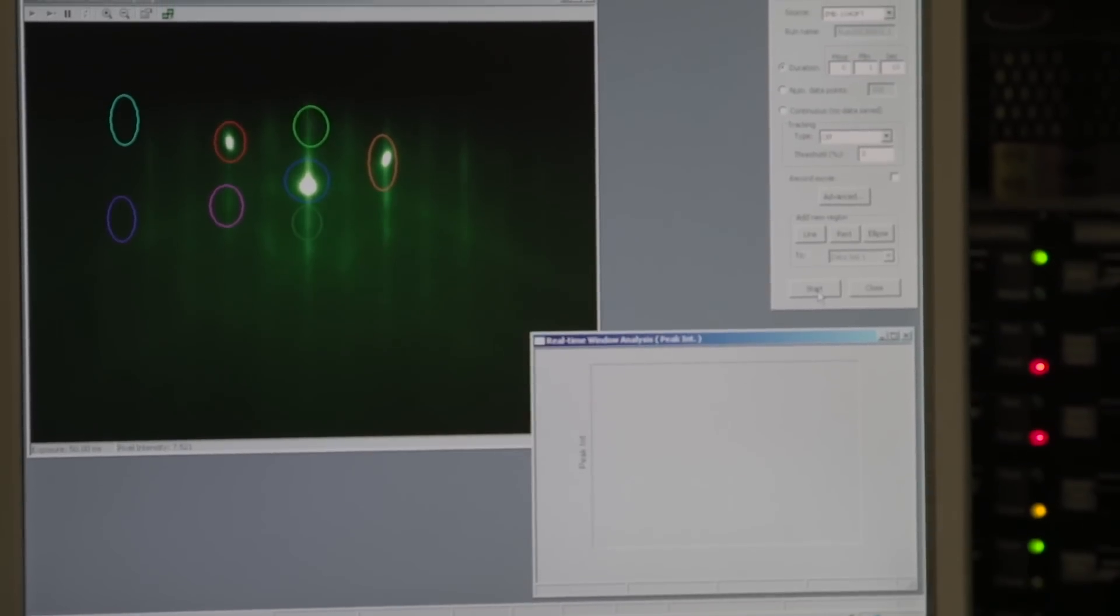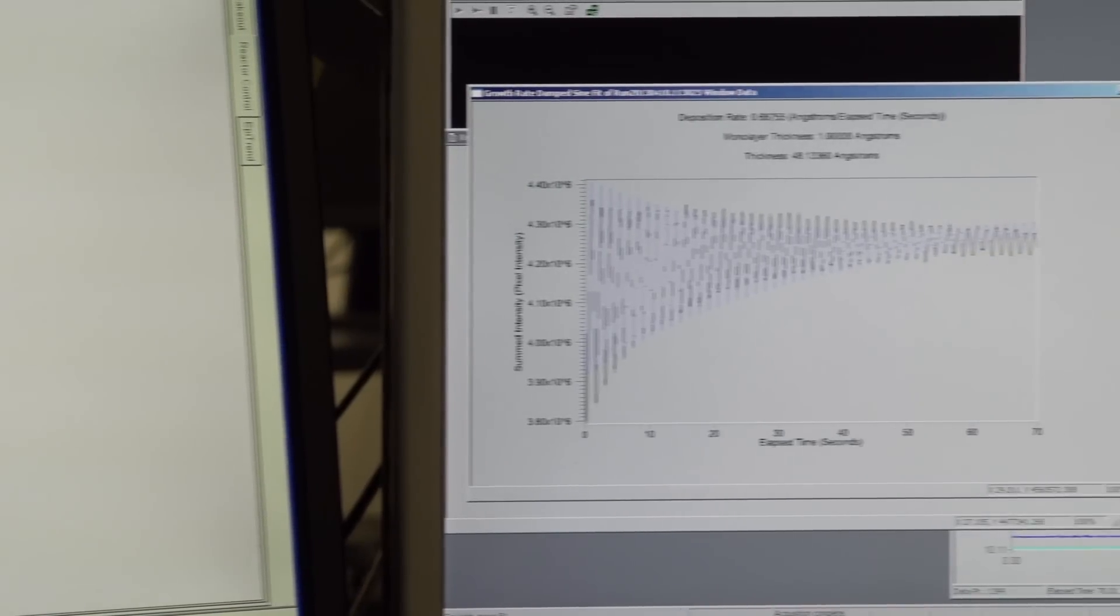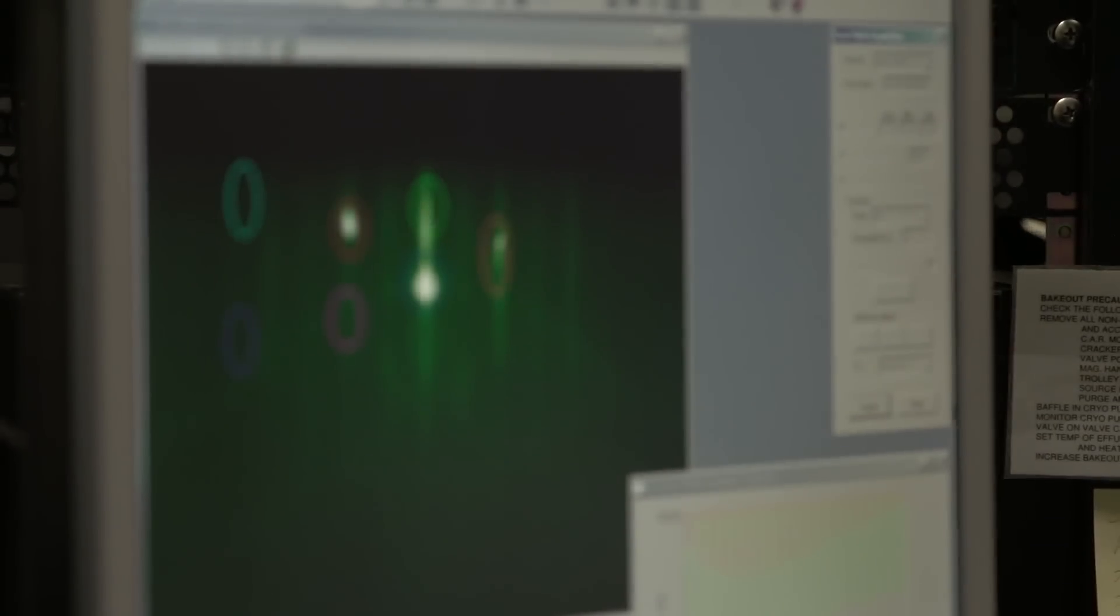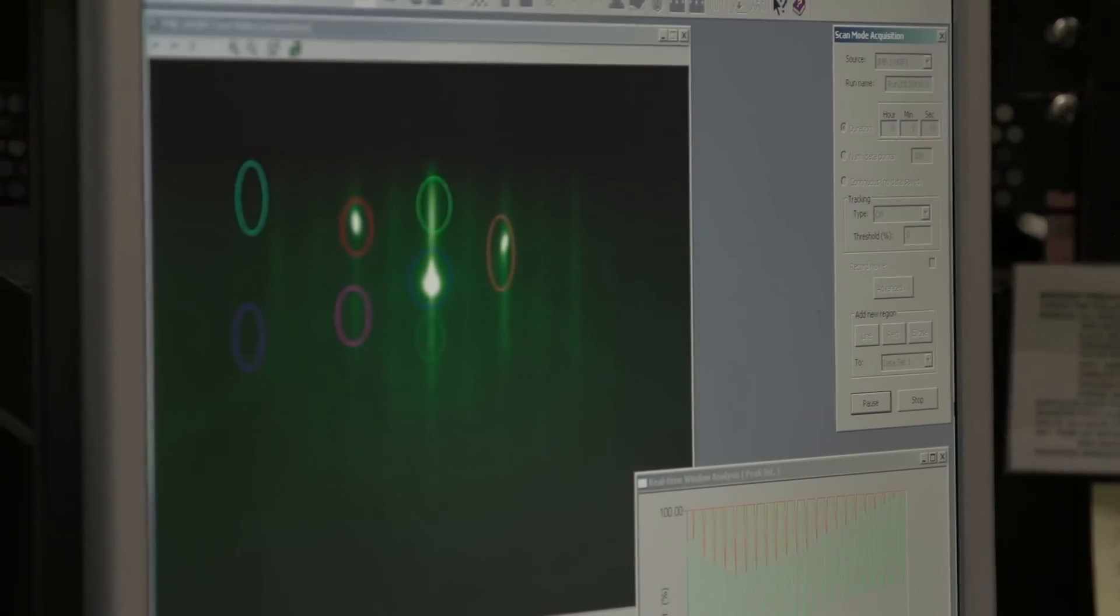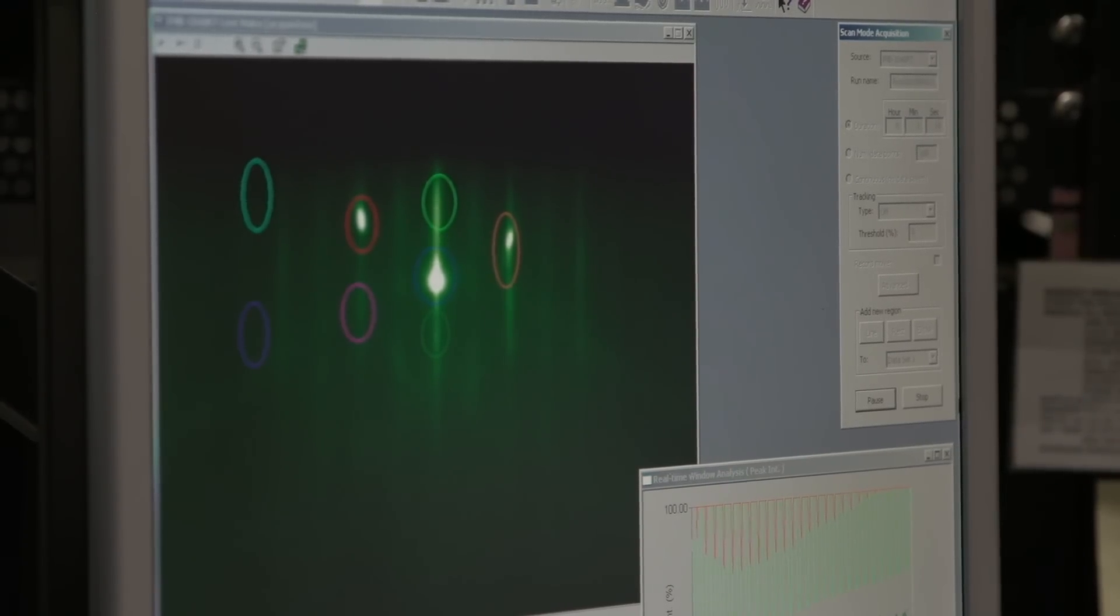But the single most critical thing for me on a day-to-day basis is that you'll actually see the entire electron diffraction pattern pulse. So if you take the KSA 400 software, and this is one of the things I love about it, you can put various circles or ellipses around various spots on the pattern and try to pick spots that are giving you the most intense oscillations.